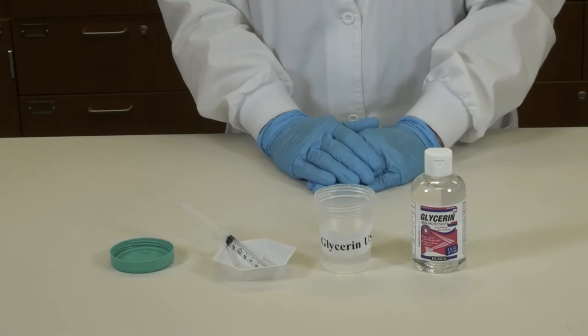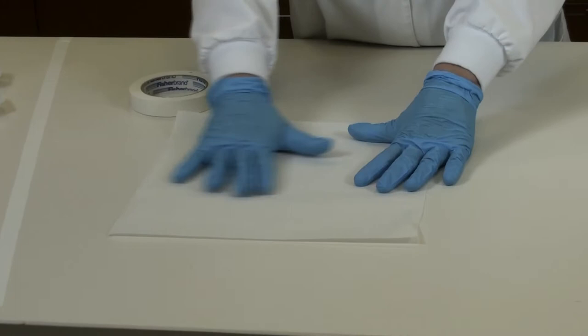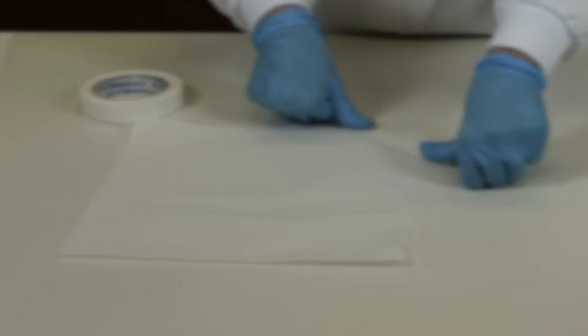Retrieve some ointment paper and some tape from the supply stations and place it on your counter for a work surface. Go ahead and use 4 pieces of tape, one at each corner, placed diagonally, to tape down the ointment paper.